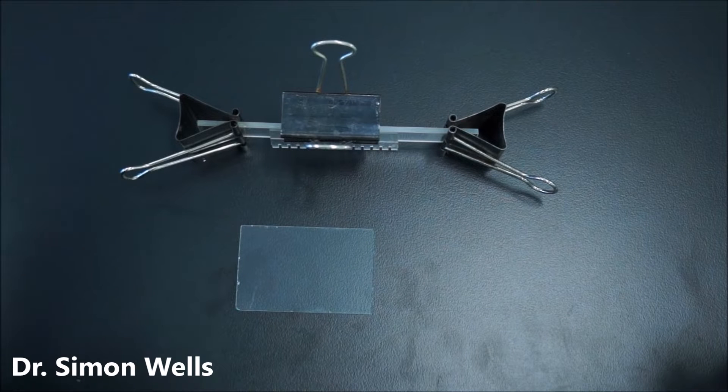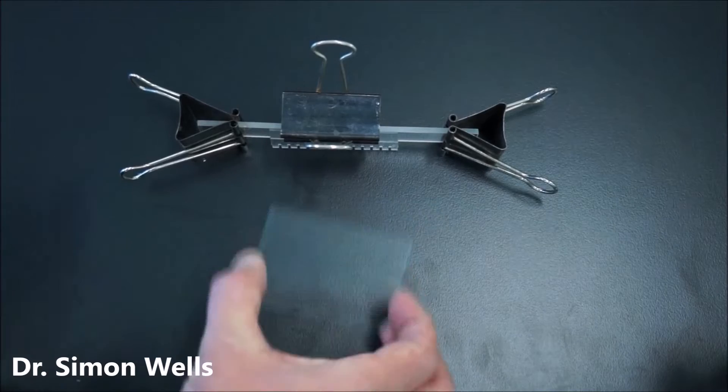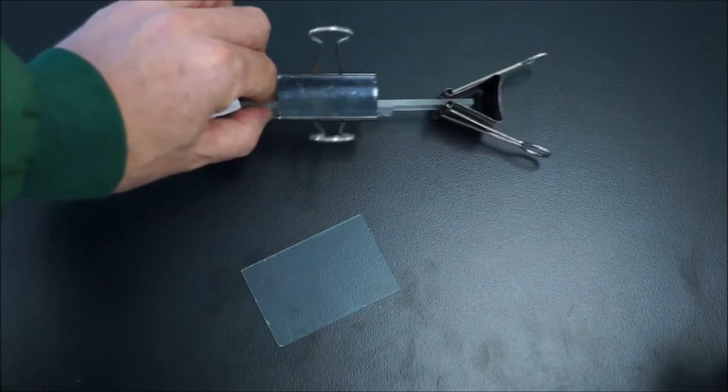The first thing you should do when you're setting up for your gel is to find the apparatus that you need. You'll need a glass plate and a comb that's set up in this bulldog clip apparatus.